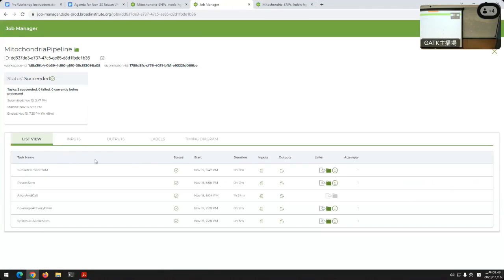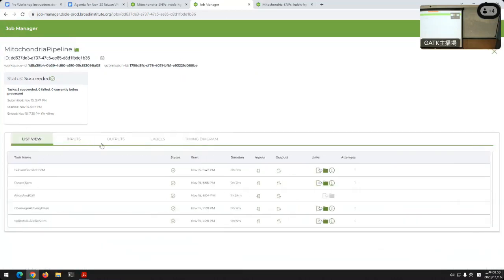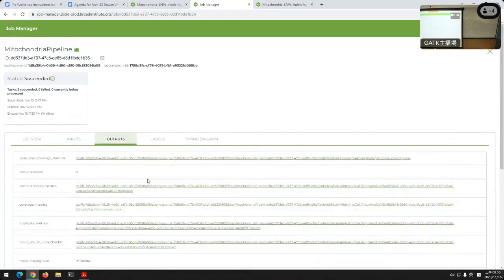When you look at the data, you can see a lot of what's going on, all the individual tasks that were in there, inputs passed, you can actually check per task. Outputs, for instance, here's everything the pipeline spit out. You've got your output VCF. Remember I mentioned the really long and weirdly named Google buckets that Terra makes for you. You can see that, the FC blah, blah, blah. That's the spot in your Terra bucket where it dropped it. Don't worry, you'll never have to know that. But you can see it here in the outputs, okay?